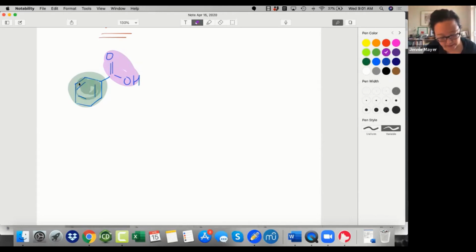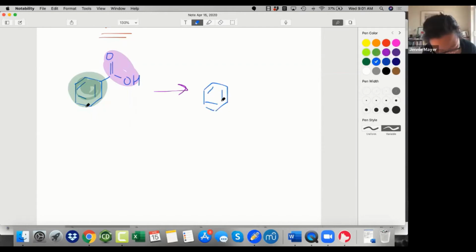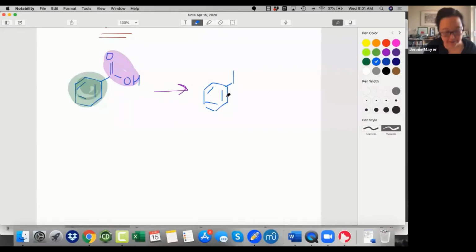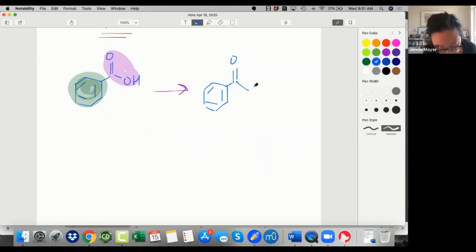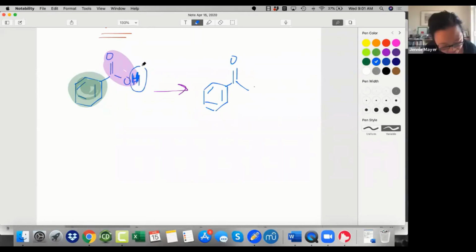So do you guys remember that I can actually take advantage of a chemical property of this to make it more polar? Do you remember what I need to add to make it more polar? What do you guys think? Yeah, Manuela, go ahead. I just think you add acid. Close. This is an acid. So what should I add? Base. A base, right. So this is an acid, and what I'll do is I'll add a base.